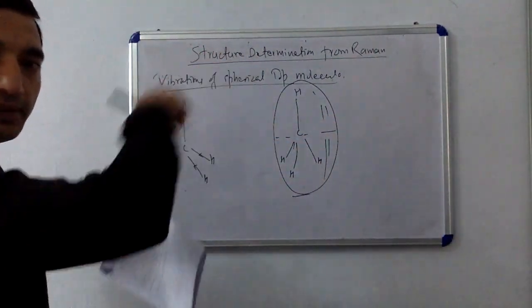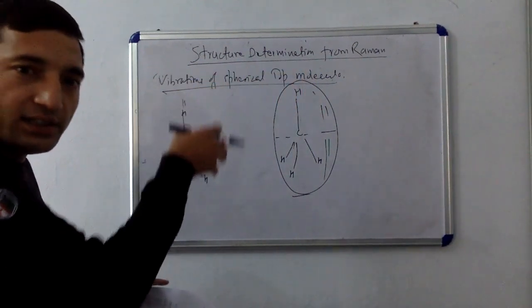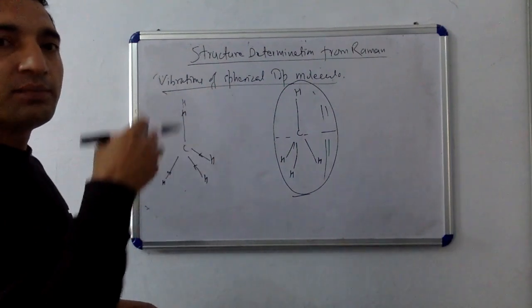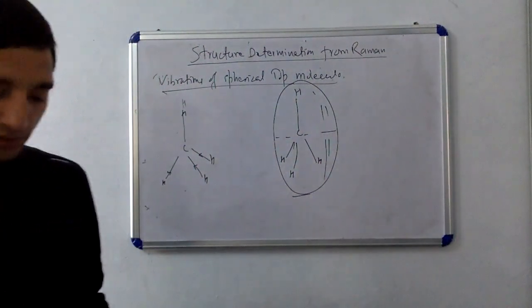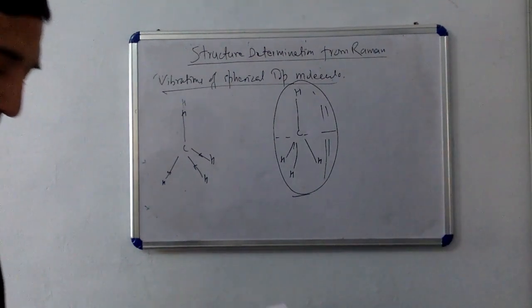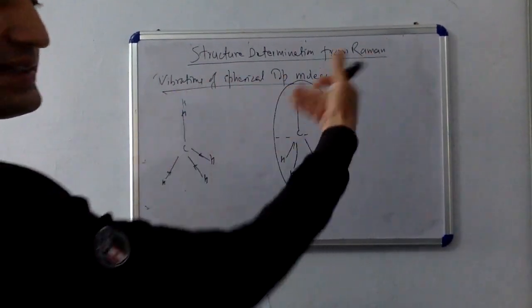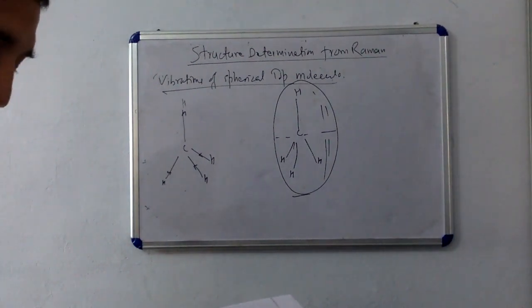When it was symmetrical, all directions had the same polarizability. But in this case, due to a little bit of asymmetry, the maximum polarizability will be along the easiest axis of this polarizability ellipse. So the easiest polarizability direction is the minor axis of this molecule. In a sample, these axes will be oriented in random directions. You have this three-dimensional surface, and it can be in any direction relative to the direction of incidence.